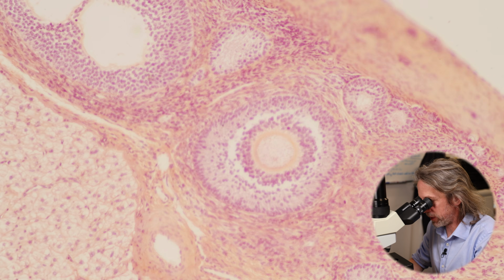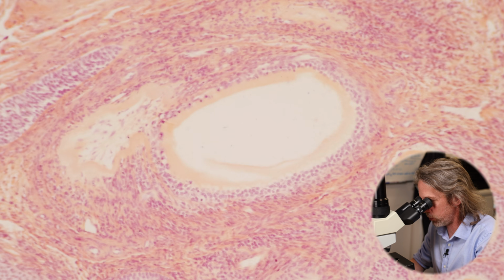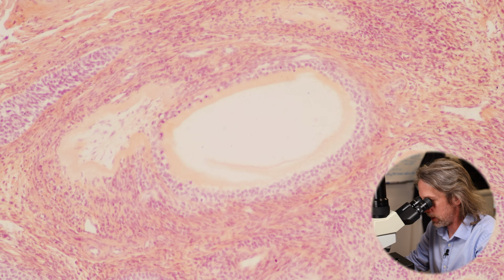So that's our very pretty secondary follicle. All of these circles in here are just missing the oocyte because of the plane of section. These are our Graafian follicles.